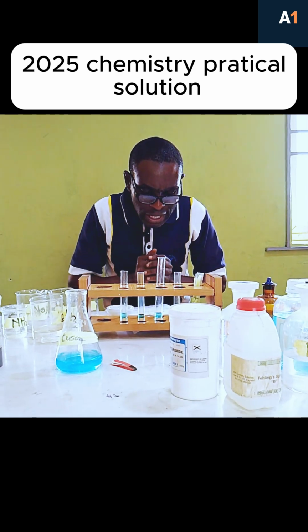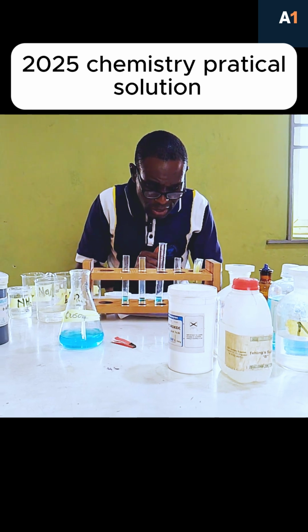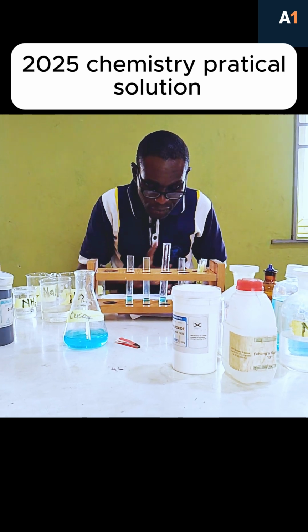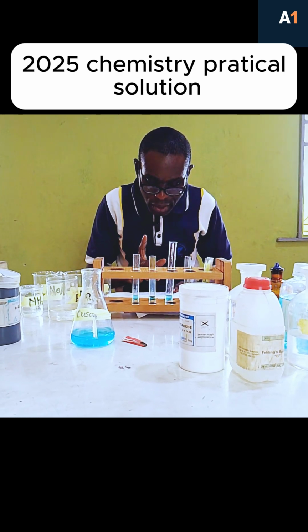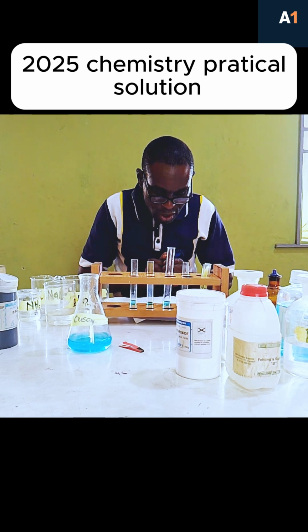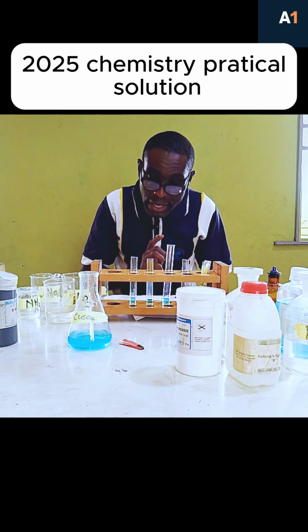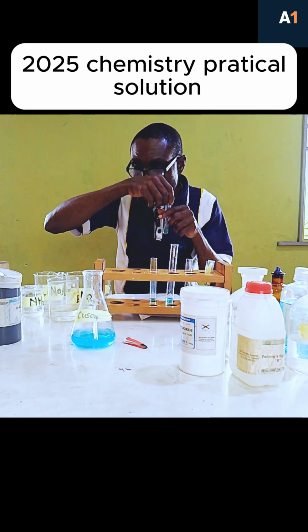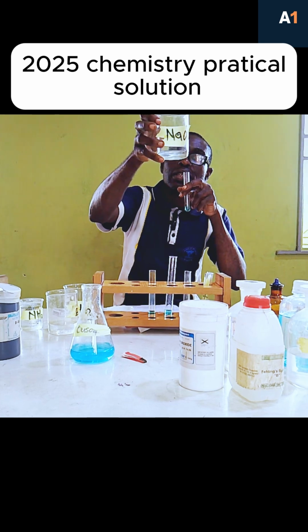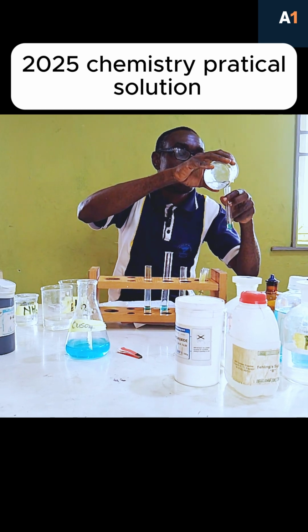Then the next one, the second portion. If you check what I just explained on the board, now let's confirm it. We have said the first portion is soluble in water. So you can see soluble there. The second portion has no effect on the litmus paper. The third one, the first thing we add, is sodium hydroxide in drop, then in excess. So let's take this one as the first one. This is the sodium hydroxide, as you can see. NaOH, the sodium hydroxide, in drop. We have to do it in drop. Let's do it in drop.